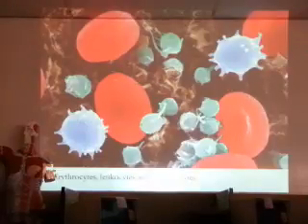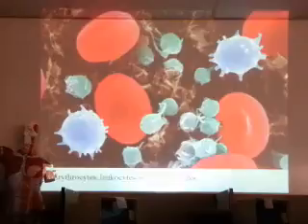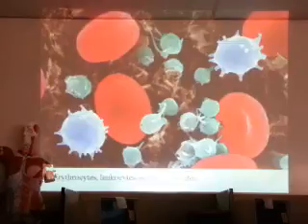And then we have these white little round things. These are probably lymphocytes, white cells. They look a little smaller, but it's because of the three-dimensional structure. Once they're on a microscope slide, they flatten out a little bit, so they look a little bit bigger than that. And we have platelets in circulation.